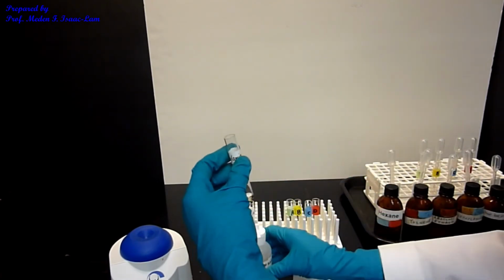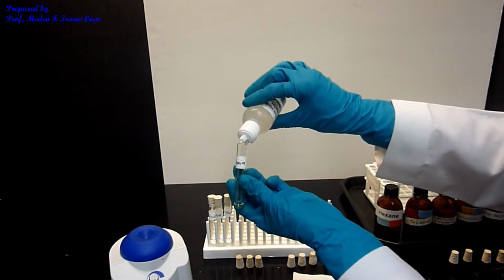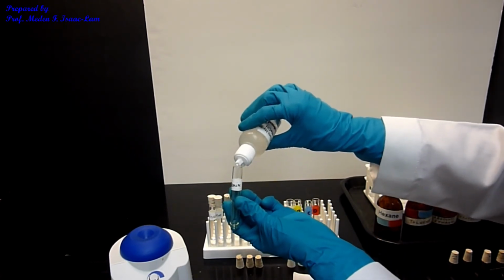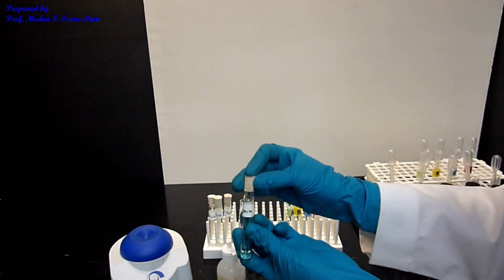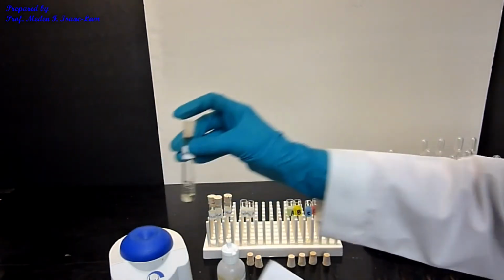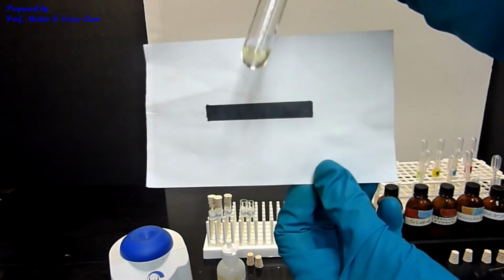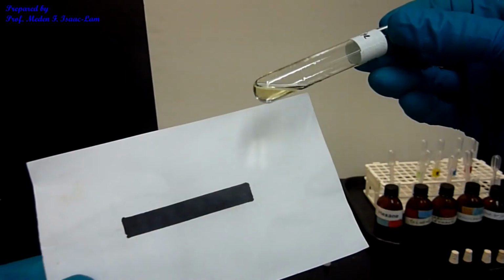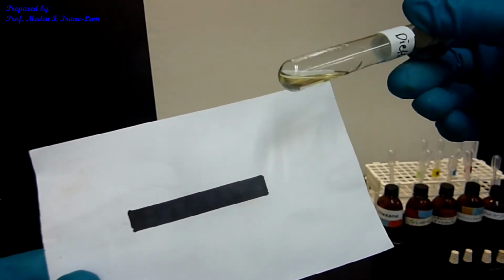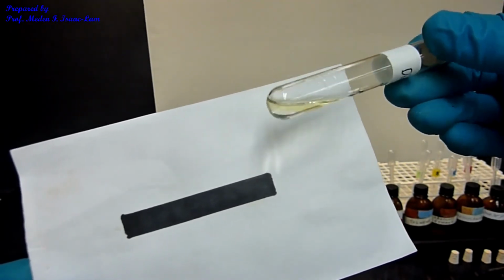So diethylamine is this sample. Okay, and then stir it up. There's a little bit of droplets on the side. So this is diethylamine and sodium hydroxide. It doesn't look like it's entirely miscible.